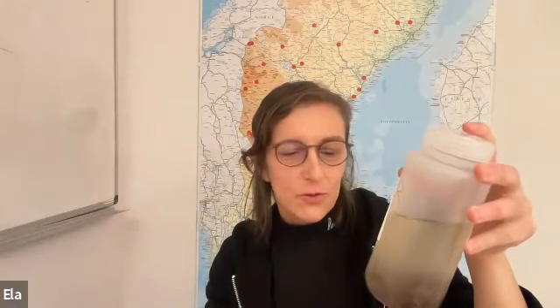And from those samples, in our protocol, we describe all the way from those samples to DNA sequences, and you can decide based on those sequences what species are inside, and in this way describe those species communities in space and time. So it's a very powerful method that gives quick access to information about the whole insect community.